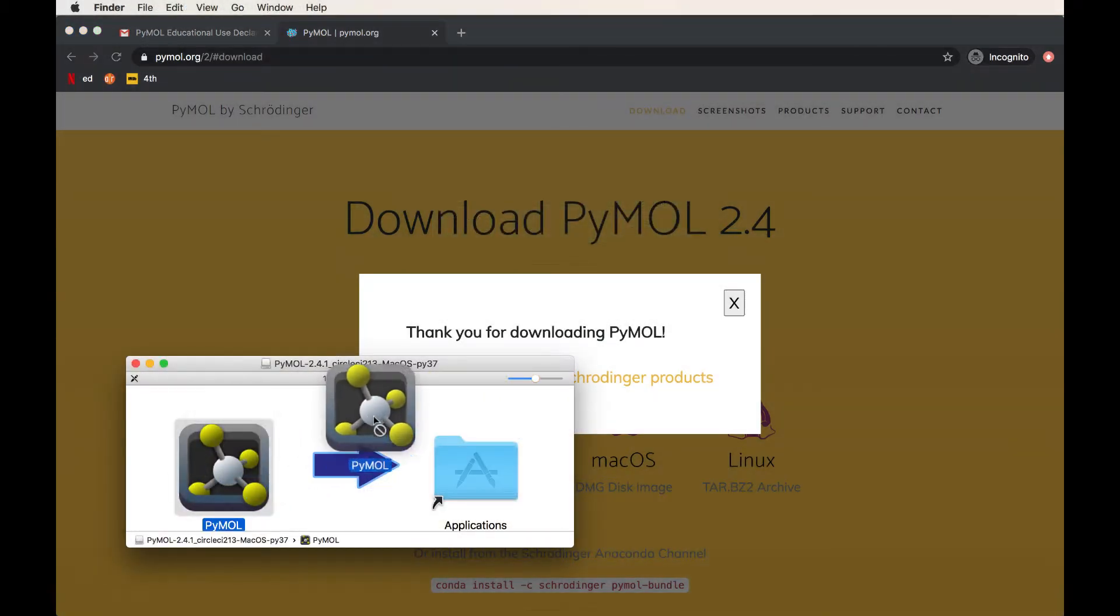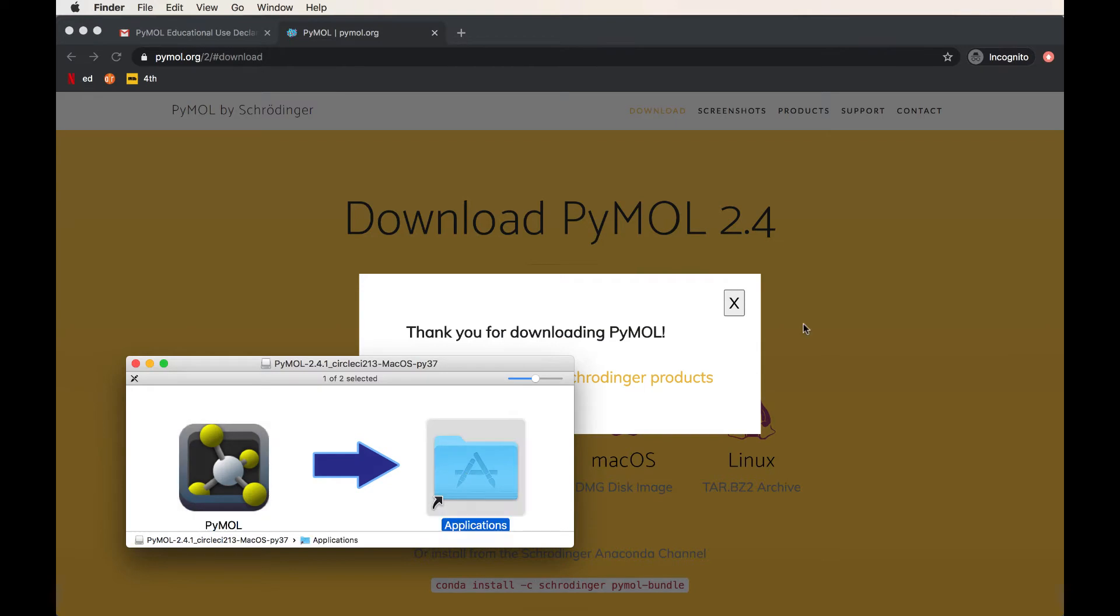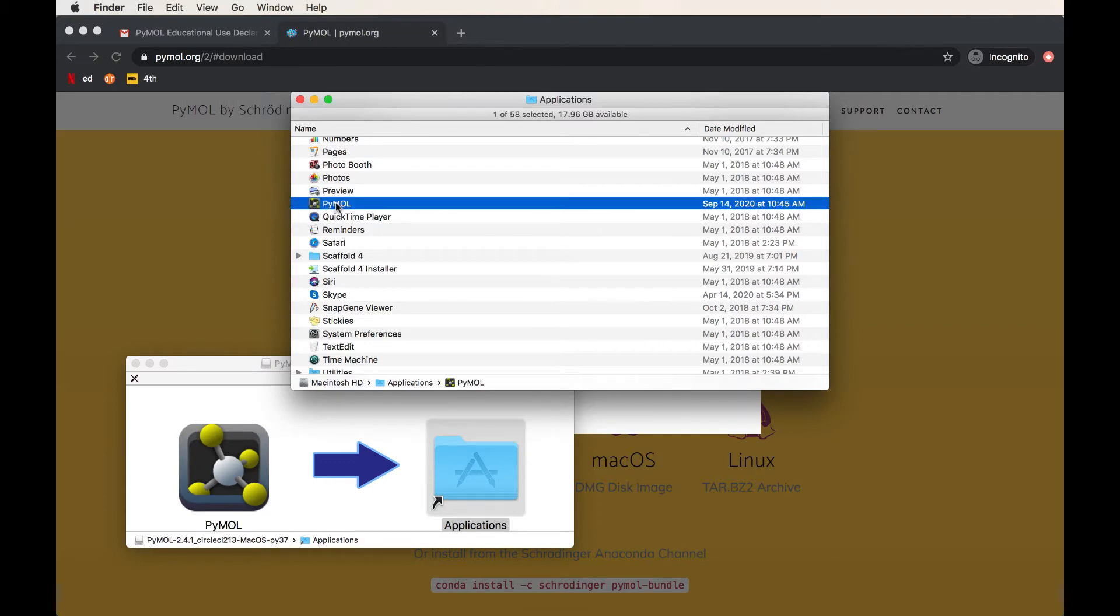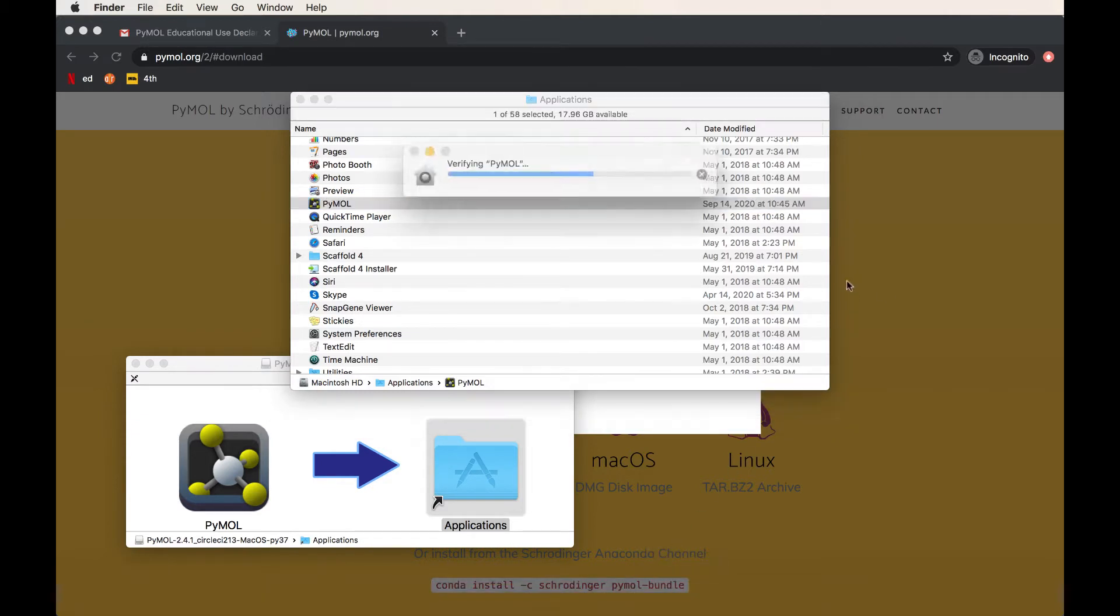And this is how your computer will download any other software. You're just going to wait and go through a series of prompts to get the software onto your computer. Now we're going to move the application to our applications folder. After a few minutes, you should be able to see the PyMOL application in your applications folder.